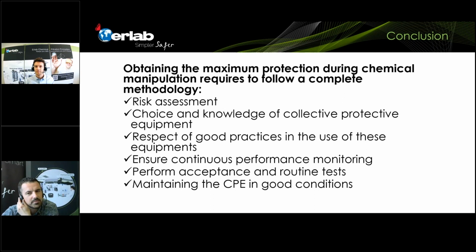So I just wanted to add something to clarify the wording of all these units, because a lot of people ask for fume hoods, laminar flow cabinets, PCR workstations, and biological safety cabinets class 1, class 2, class 3. So Moraine was pointing out that the best question, as you said, is to ask yourself: do you need to protect the user, or do you need to protect the samples or the products? And then the solution will be different, of course.